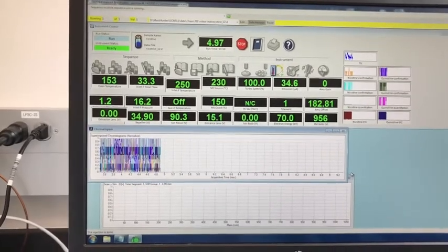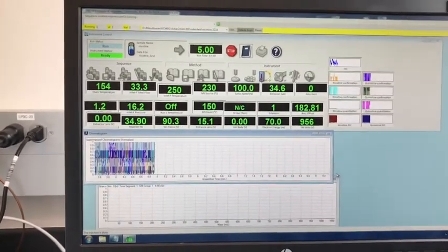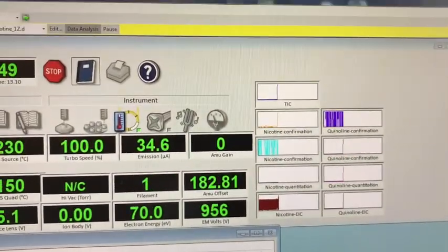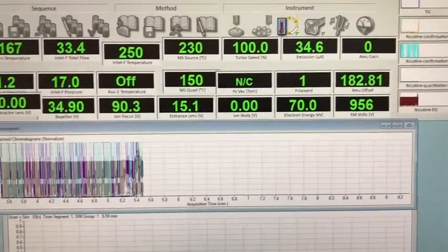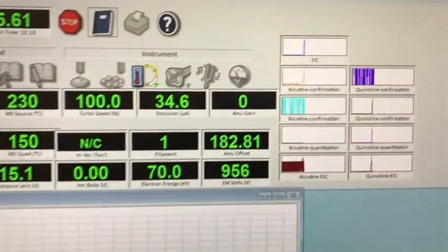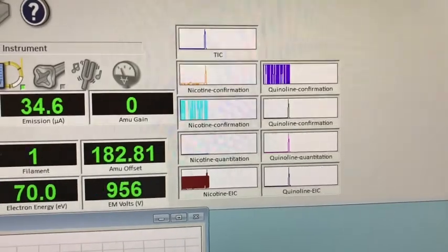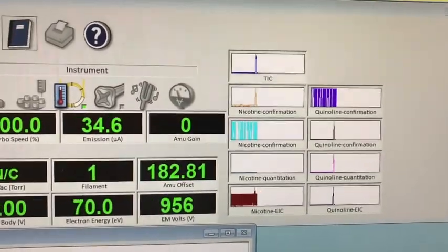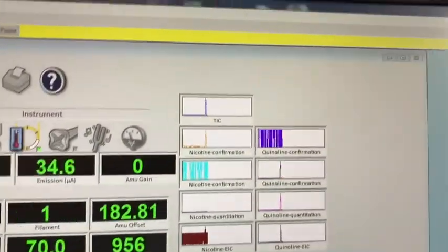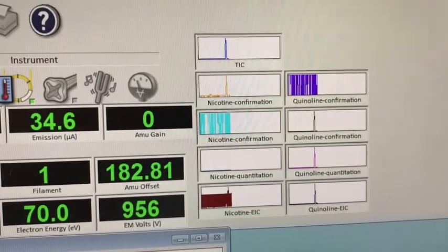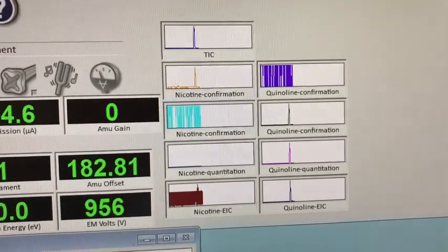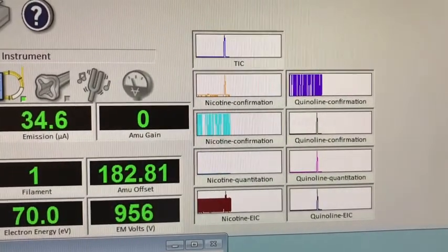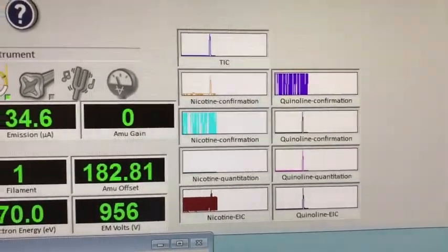Right now we are at 4.98 minutes. If you see on the TIC, there's a peak coming out right now. You'll notice it's confirming more for quinoline than nicotine, even though their peaks are very similar. Their mass spectra have some very similar m/z values, but you can notice very clearly that the first peak is quinoline, because that's the one that came out first, and it's confirming as well.